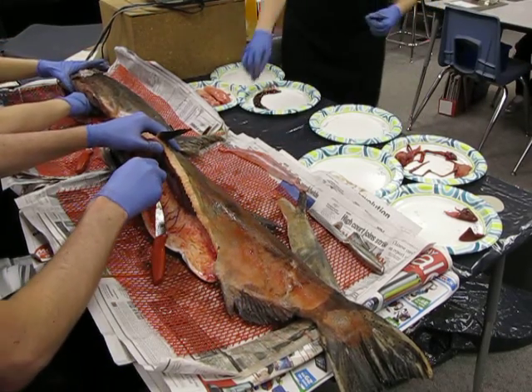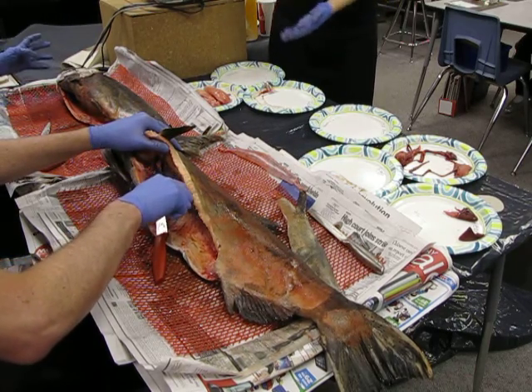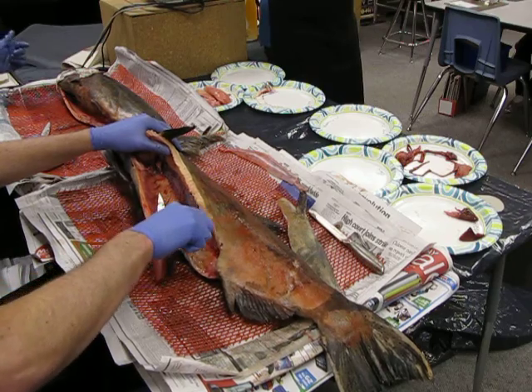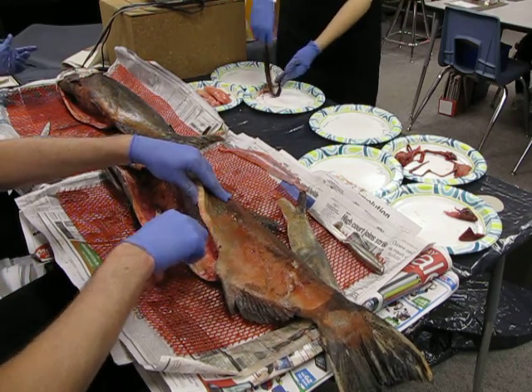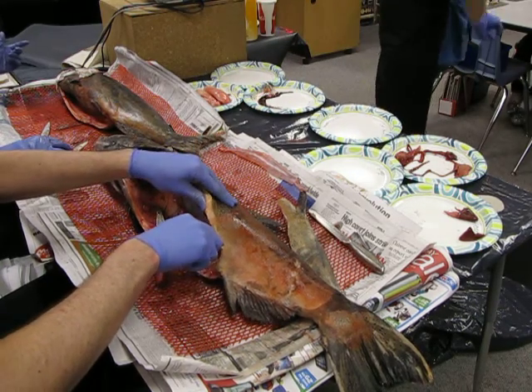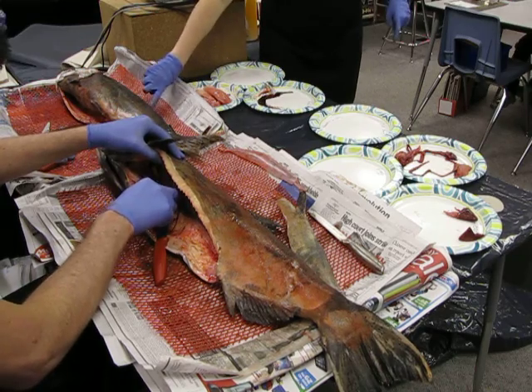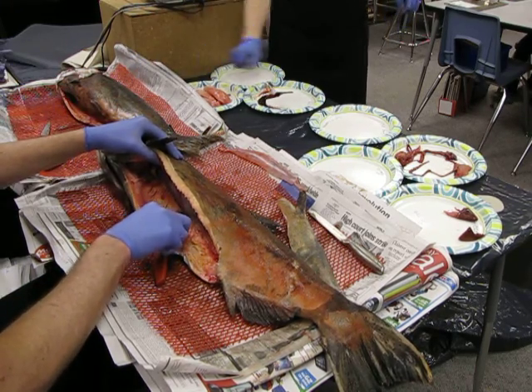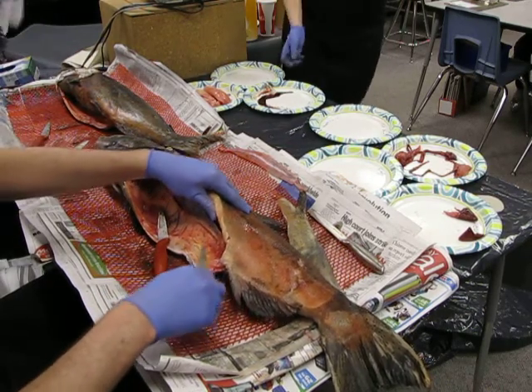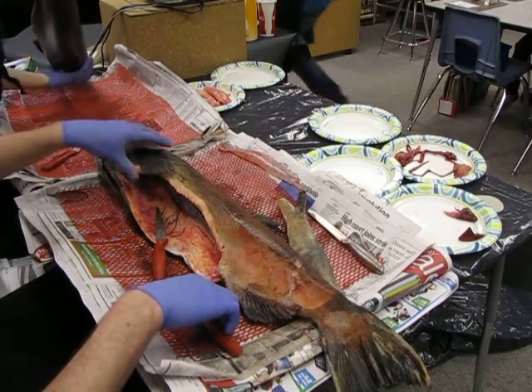I also have over here a salmon kidney. I'll lift it up once and then I'll put this under the document camera also. This is a salmon kidney. You guys have 2 kidneys in most of your bodies, and our kidneys are kind of bean-shaped, they're small, and they're at the bottom of our back. Now the salmon's kidney runs all along the back of the salmon. Here, I'll show you. Naomi's going to show us where it sits.